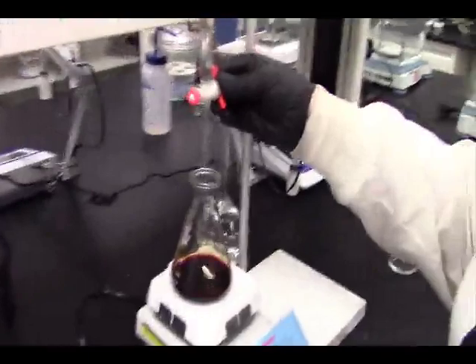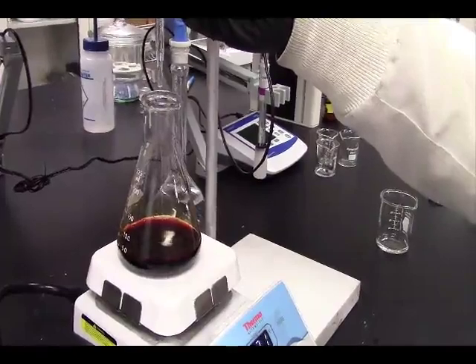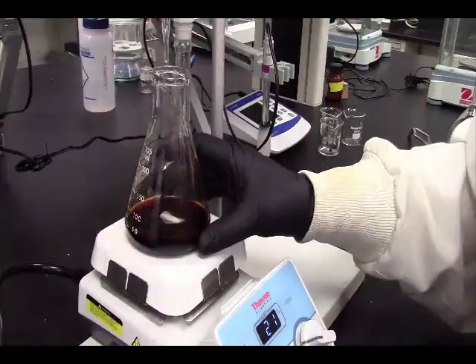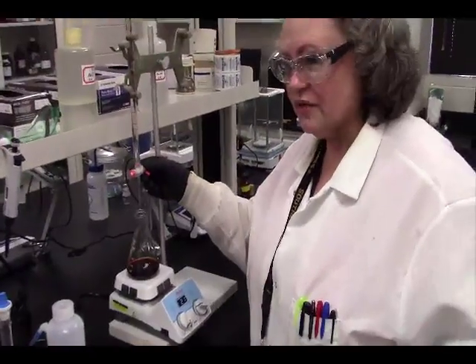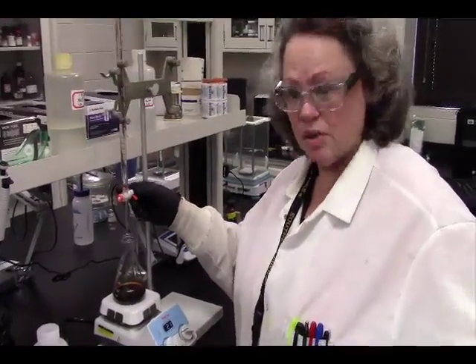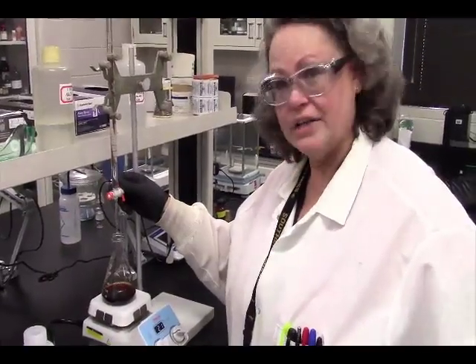Stopping periodically to give the reaction time to catch up with what I'm putting in there. So the gist of this is we need to titrate this with our thiosulfate until we get a straw color. Once we have the straw color, we're going to add our starch indicator, which will then make it blue, sometimes really dark blue. So you can't add your indicator too soon, because the indicator in this will just look black and it will make solid iodine, and it's really hard to get back in solution. So you have to almost complete your reaction before you add your indicator.